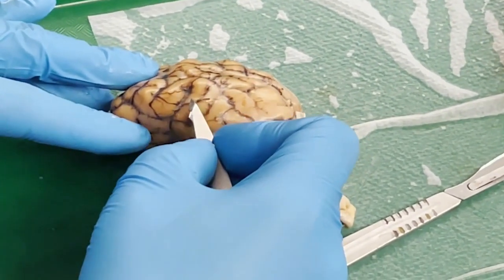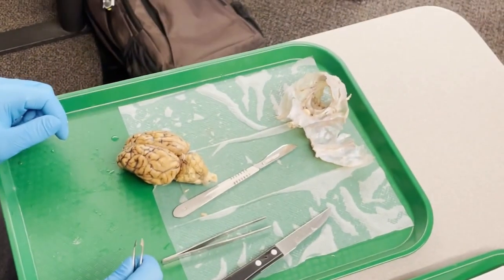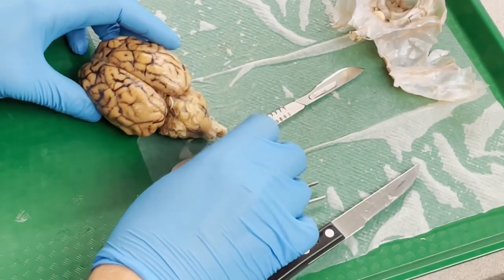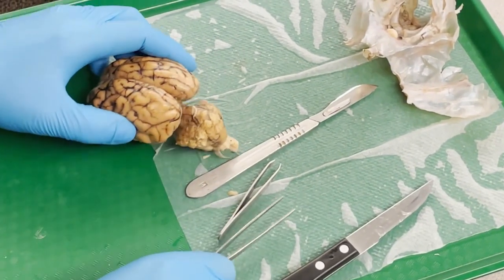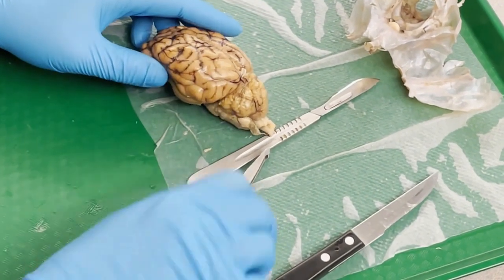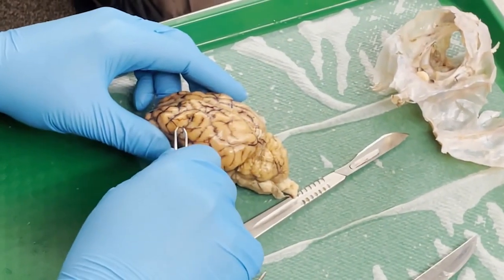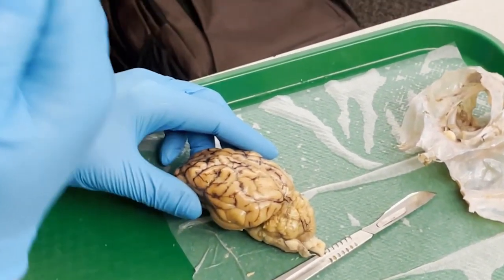Now, in the past, when people have read through the packet, they assumed that you had to remove all the pia mater. Don't ever do that. You'll spend the entire period doing that. We don't need to do that, basically. And if the brain dries out to a degree, you will see the wrinkling of this membrane on the outside first before anything happens to the brain itself. But we don't need to take it off. You can try to pull off a small piece if you'd like, just to kind of see it in isolation. So I'm going to pick one of the sulci here and then just kind of peel off that membrane tissue. There's like a little wisp of it, basically.